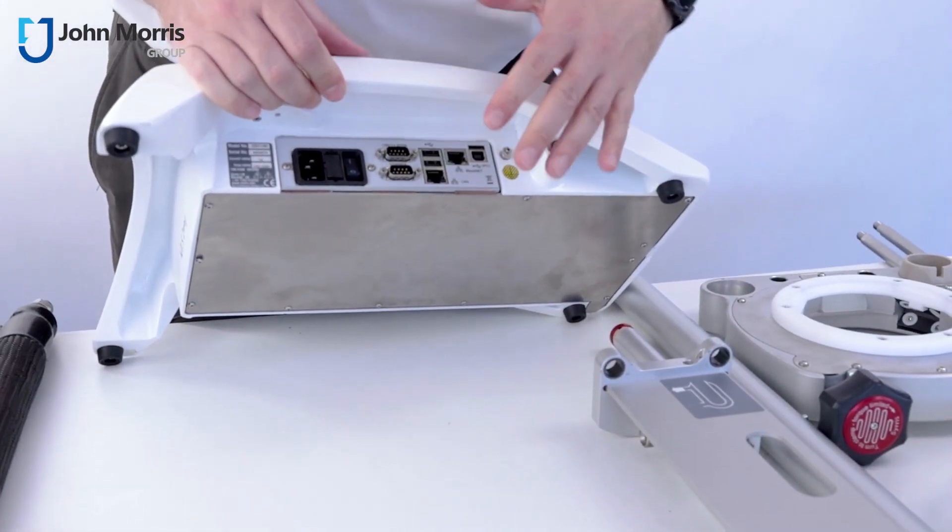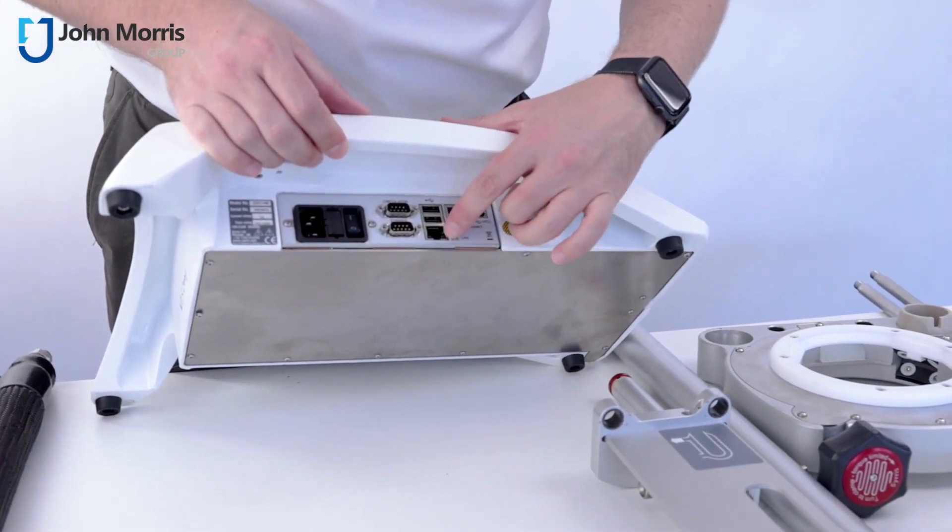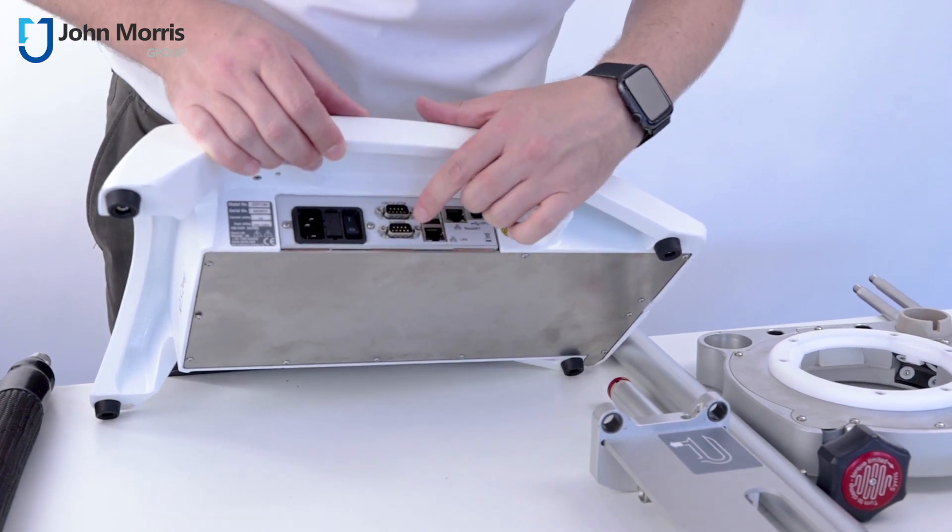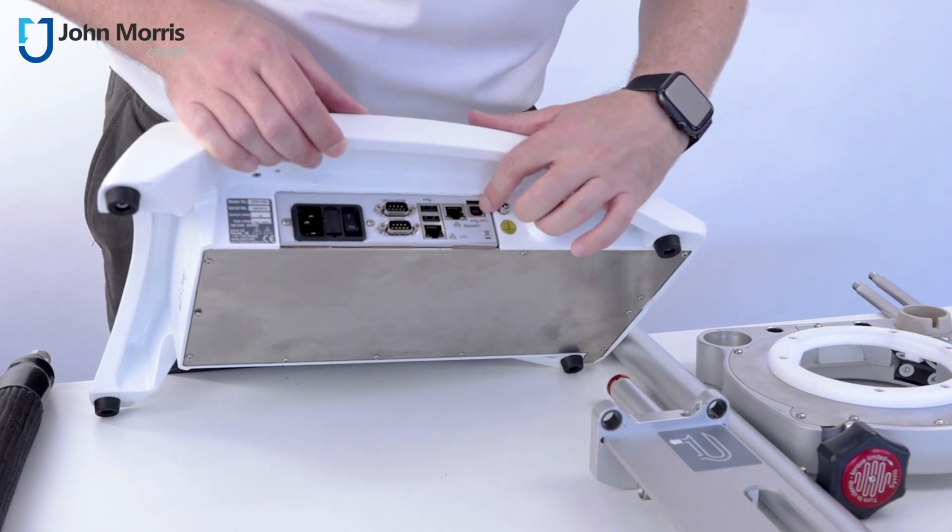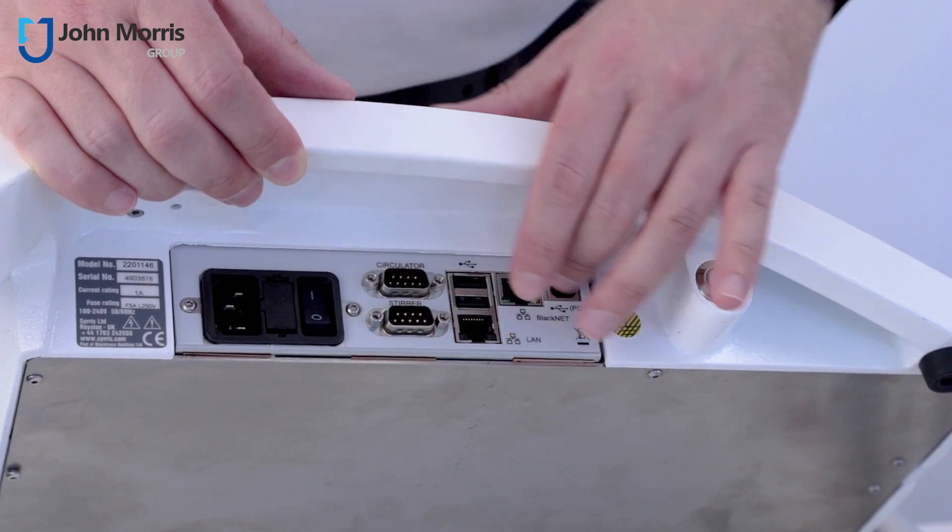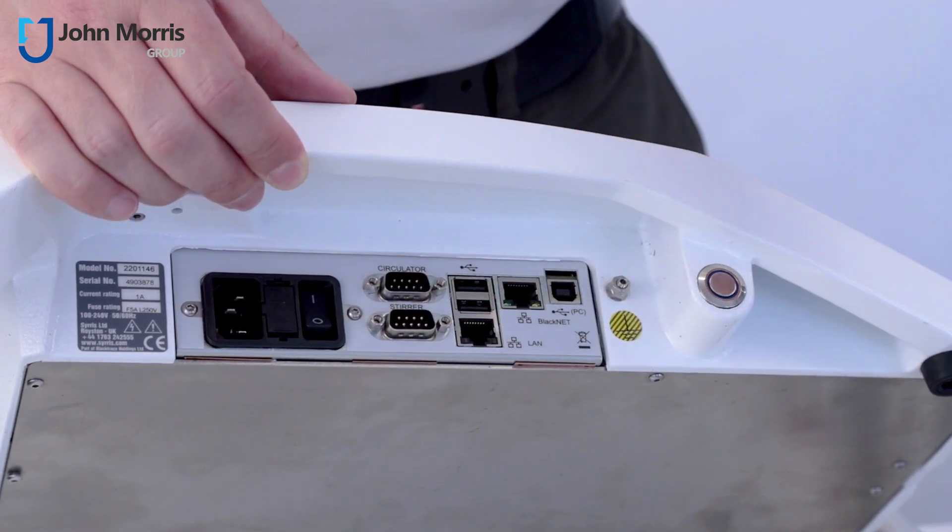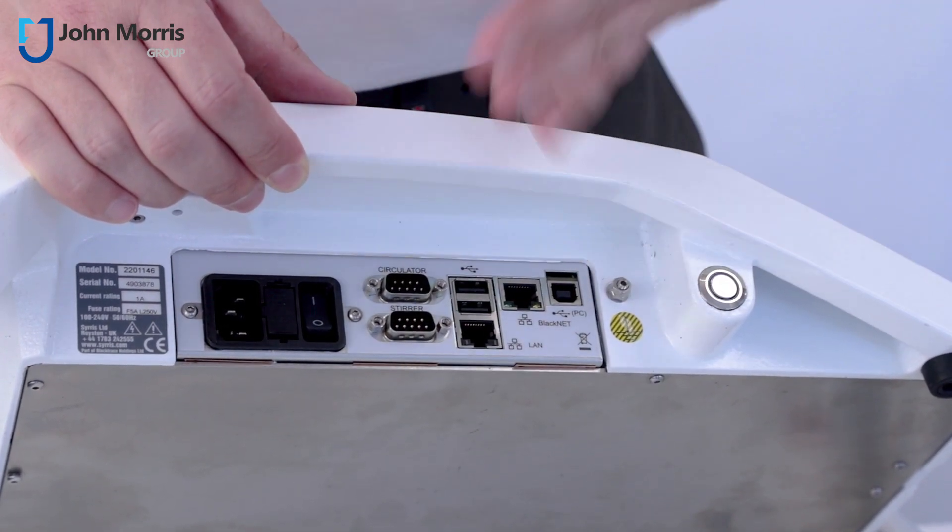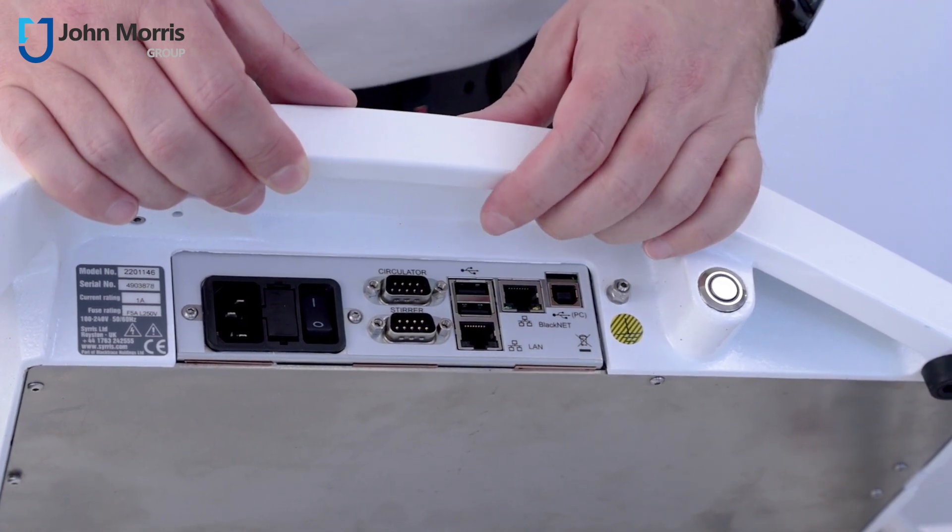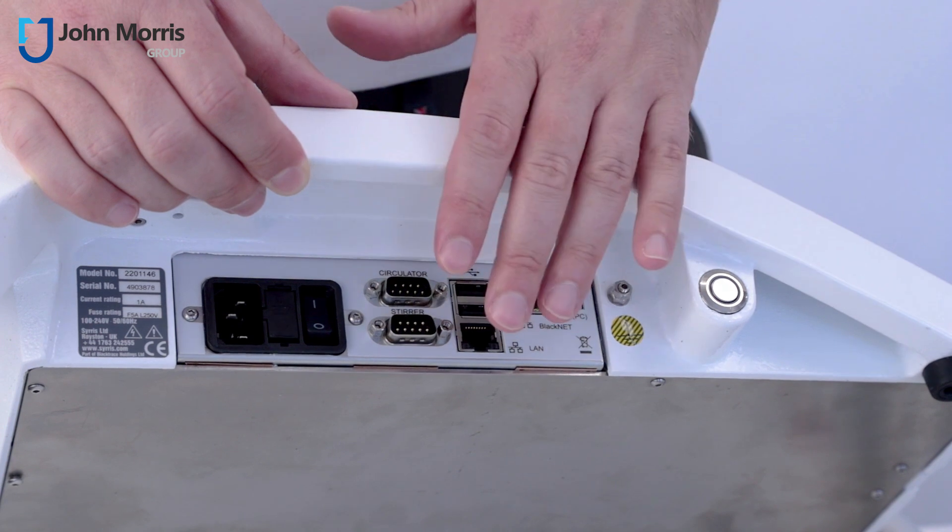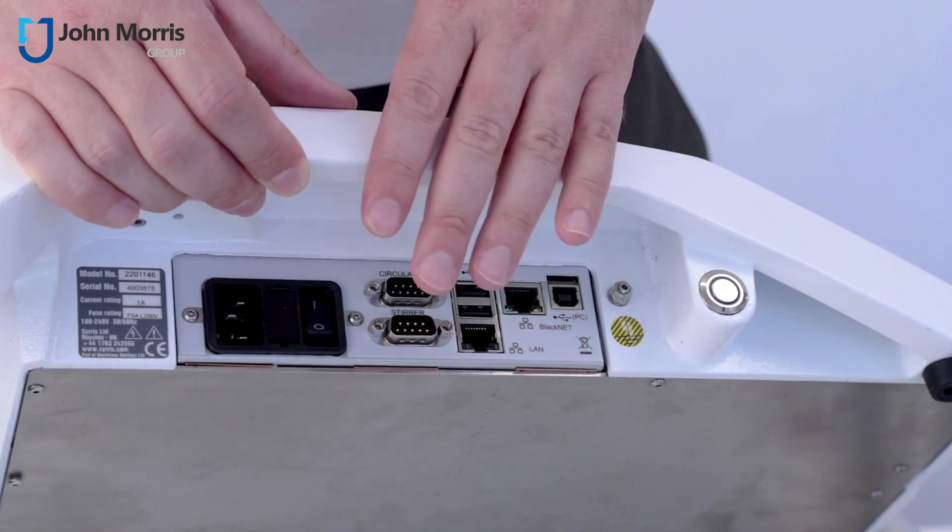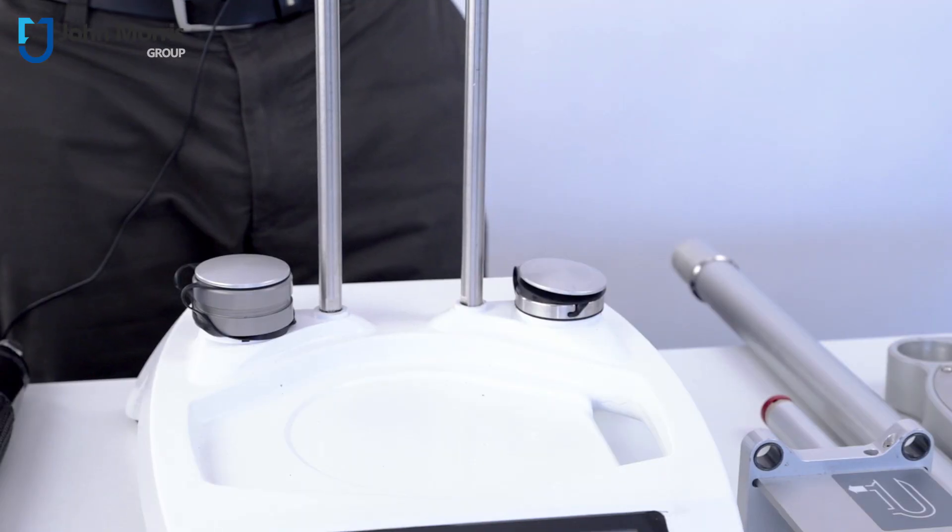So inside the Atlas HD is a full-blown computer and it offers you a range of different opportunities for connecting this computer to your network. You can see you've got LAN, you can see you've got serial interfaces, you can see you've got USB connections, and you can even automate other devices using the Atlas HD or by connecting this to a computer and having that automate other devices. So let's put it together.